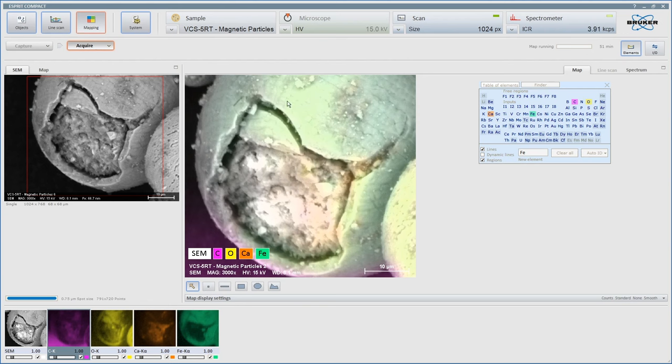Now, because there's so many samples at this point, it assesses those. So I think what we'll do is we'll go into this area here and do a more detailed sample. The interesting thing to note here is that it does appear that this inner section is made up of a whole bunch of toroids. Okay, and I'm wondering if these toroids in here are these structures that we see, these calcium and oxygen structures, and they somehow aggregate together, and that they are the magnetic charges that come together and then produce this overall structure. So we're going to have a look a little bit closer into these as we go forward.